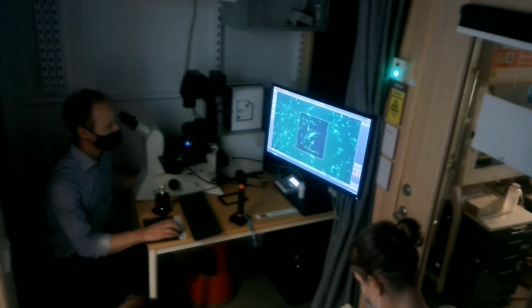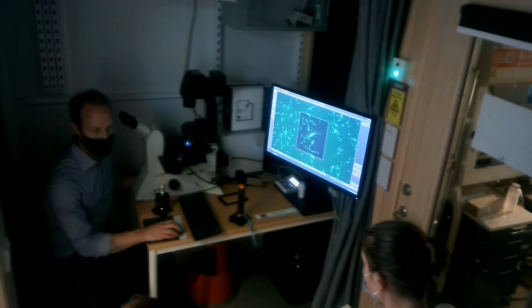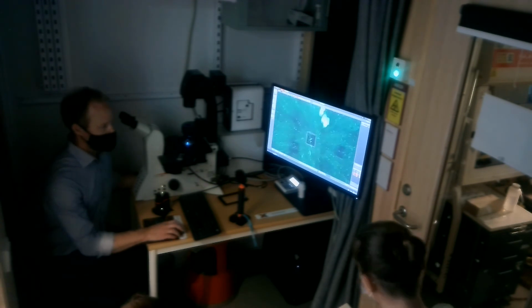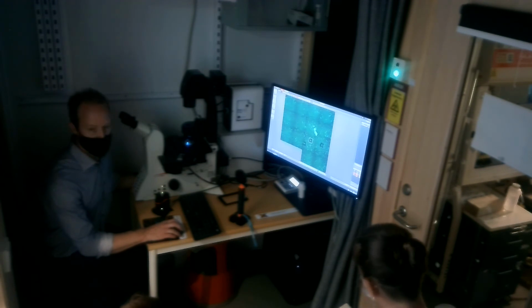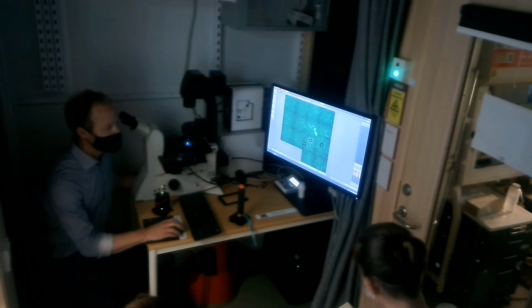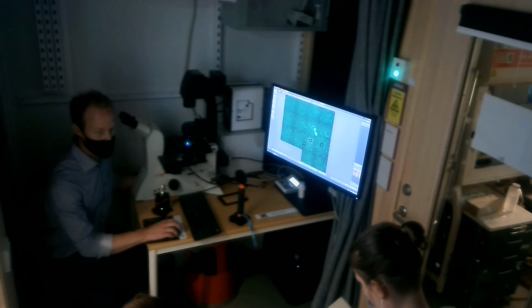So if I go live now, I might adjust the Z a little bit. But this Z value is not saved with this position. So if I use this one to put a bunch of single images, I would have to use something else to adjust for the focus differences in my sample. So if I have a fixed sample like this, and I want to do multi-position, I will use the mark tool, because it also saves the Z. Yeah?